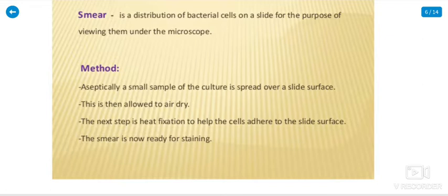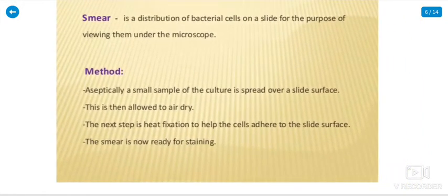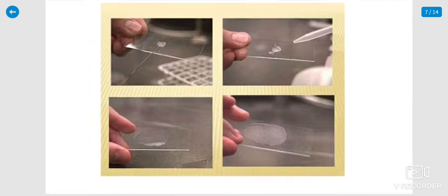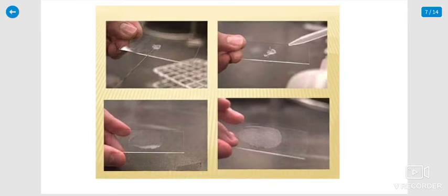And the fourth step: the smear is now ready to stain. These pictures show drops of microbes applied and then smeared and spread out over the slide.